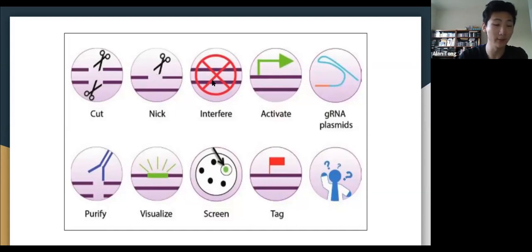You can interfere with that DNA strand. You can attach a transcription-inhibiting protein to the Cas9 and disable all the endonuclease domains. So basically say, hey, don't cut, but find that sequence and bring my inhibitor to it. That will interfere with that DNA sequence and prevent that transcription.